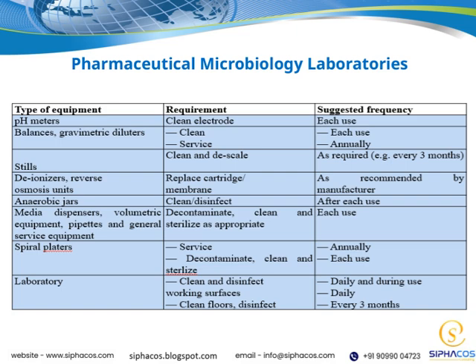In these labs, we perform a variety of tests, such as sterility testing, endotoxin testing, and microbial limit testing. Each of these is designed to identify specific microbial threats and ensure compliance with regulatory standards. It's also important to highlight that these laboratories are built and operated under strict Good Laboratory Practices, or GLP, to maintain accuracy and reliability of results. They use sophisticated equipment and follow validated methods to ensure consistency.